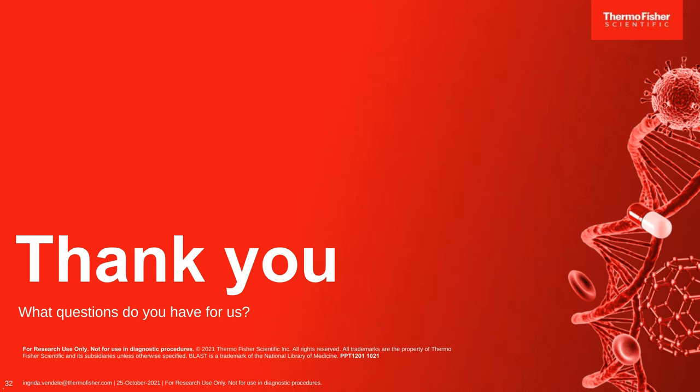Let's get started. Our first question is, can you use unpurified or minimally processed samples with the RT-LAMP master mix?